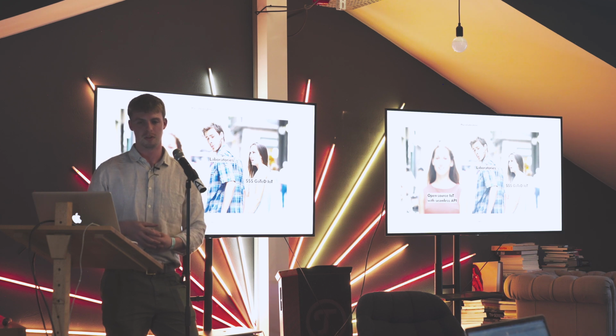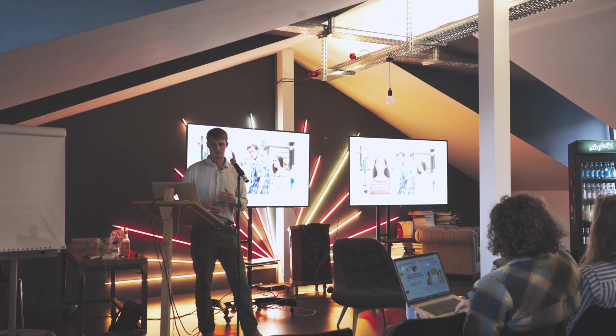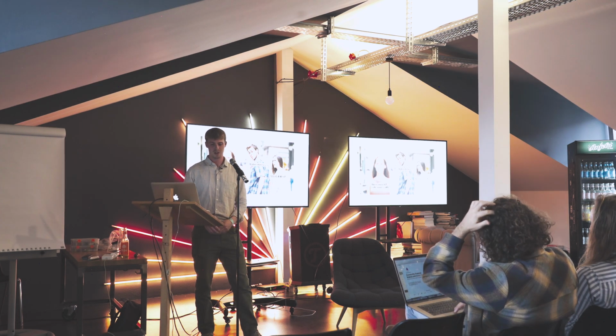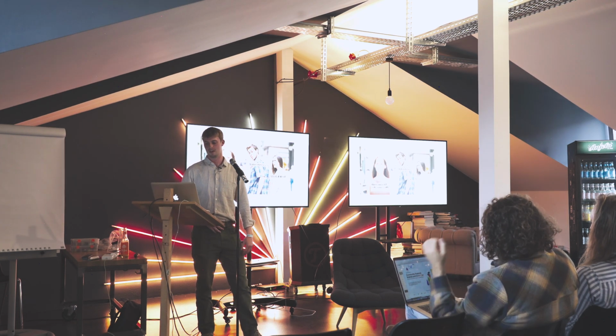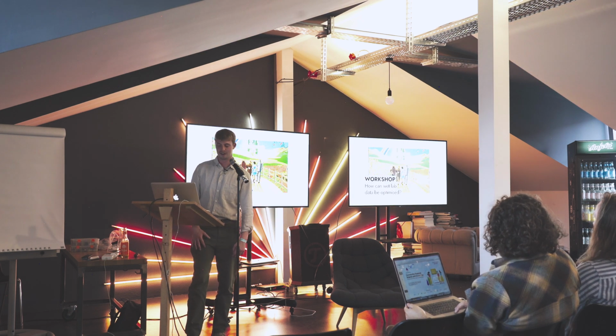And what we're hoping to do, not only with the biohotel, but also with any laboratory that wants it, is send them all the necessary software backend stuff via an open source GitHub and have people not only using it but contributing as well and suggesting new ideas, so that this can be developed in a far greater way amongst a wide-ranging, inquisitive community of people that just want to extract more information out of a general laboratory, which I think is the objective of today.